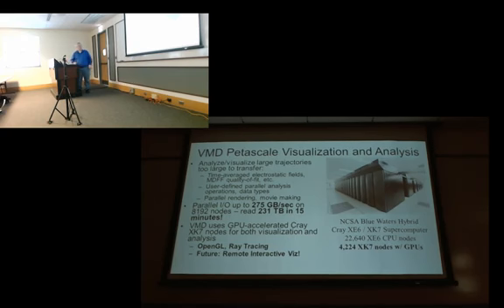I mean, it's mind-boggling. Or the analysis. You have a big storage system. So running VMD on Blue Waters on 8,000 nodes, we can read a 231 terabyte trajectory set in 15 minutes. That's pretty amazing. That's something you would never be able to do in your natural life on a laptop. So there's an opportunity there as well.